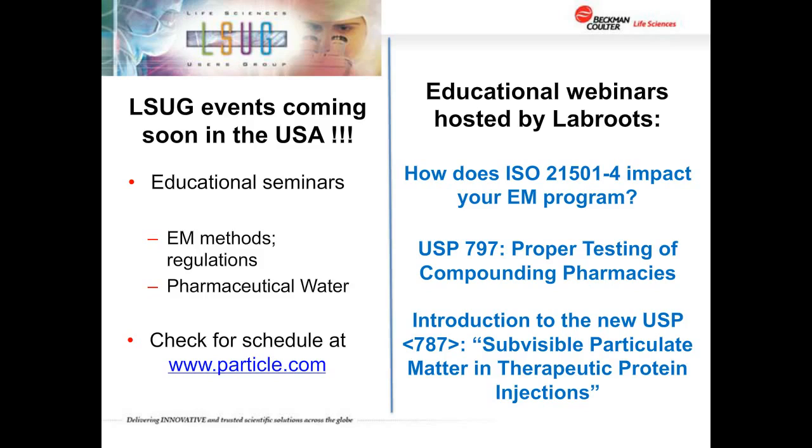In other words, a particle counter sees an organism or a skin flake with a bunch of organisms on it as a particular solid entity in the air. It doesn't think of it as viable or not, and it just says there's one of those, it counts it. So the table is really, you could say, non-viable particles, but it's also, I think, a better phrase to have called it total. And if you notice in the document, it doesn't use either phrase in discussing that in the ISO document. It just says airborne particulates.